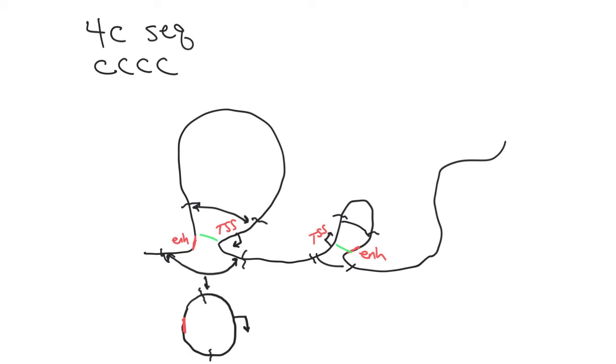So at this point, we have a couple of circular molecules of DNA, and they both represent DNA that was in physical proximity to other parts of the chromosome, because that's how this cross-linking works. It only cross-links, or covalently connects, parts of the chromosome that are physically touching each other, essentially, inside the nucleus. So what happens then is these circular molecules of DNA are sequenced. That gives us the DNA sequence of the region of the chromosome that was physically near another region of the chromosome, or a different chromosome even, at this point in development of this organism.